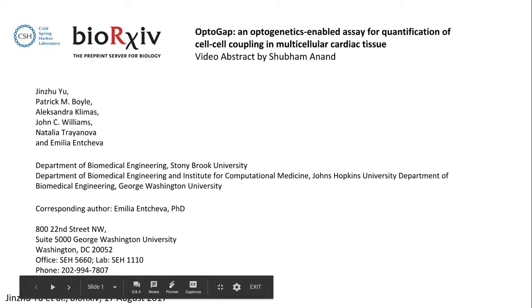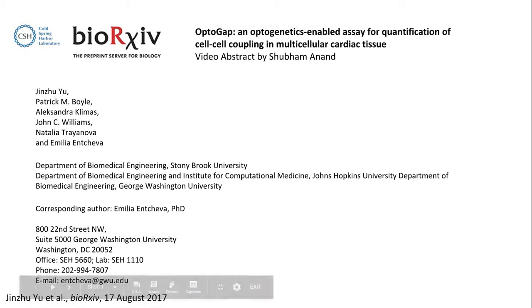Hi, my name is Shubham Anand and here's an abstract video on OptoGap, an optogenetics-enabled assay for quantification of cell-to-cell coupling in multicellular cardiac tissue. Putting it in simple terms, how do you use optogenetic technology in cardiac tissue to measure electrical coupling between cells?